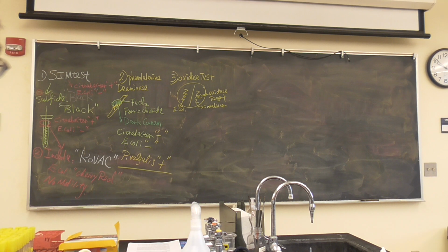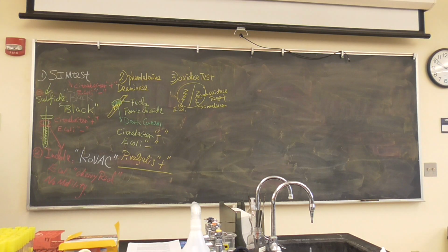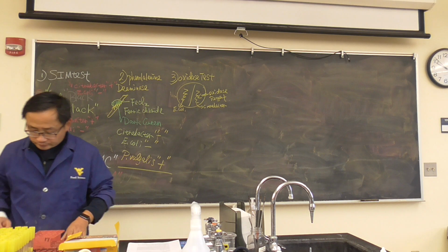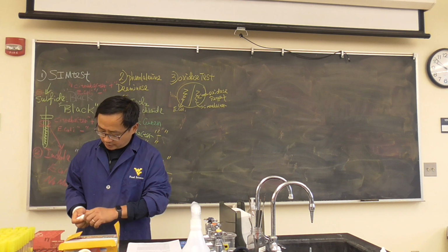Okay, let's try another one. Give it back. You can wait a little bit. Who has other plates? Just have other plates. That's okay. We'll try another one. Oxidase reagent. We'll see whether that works.